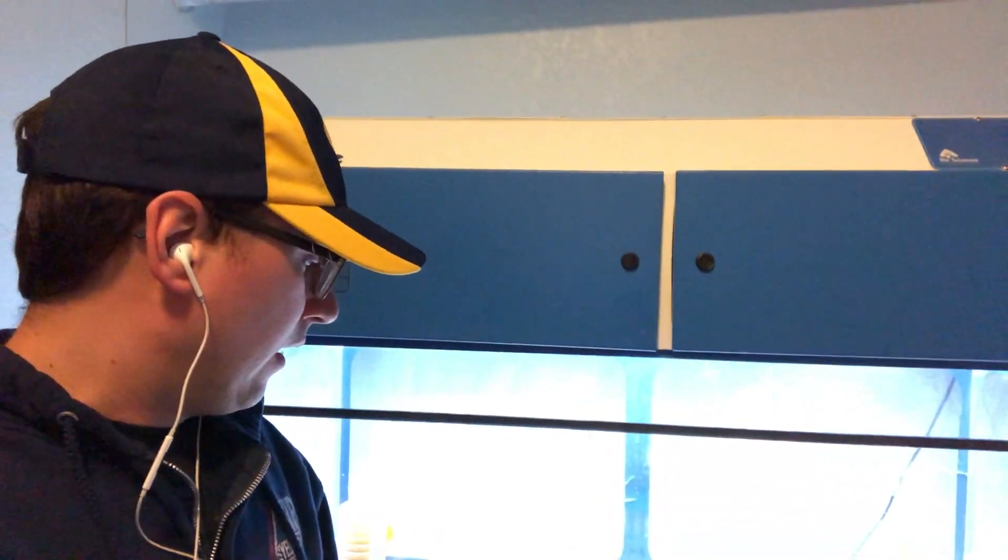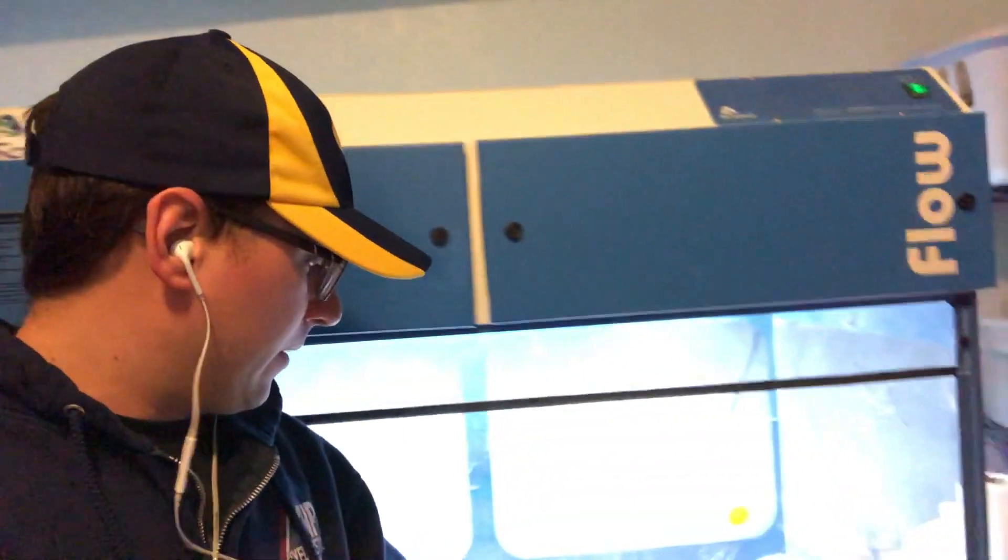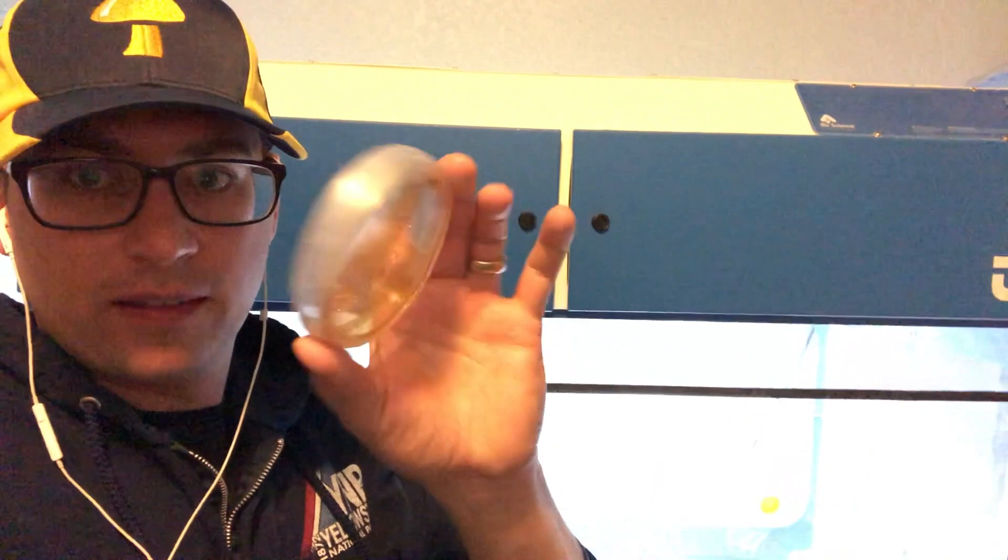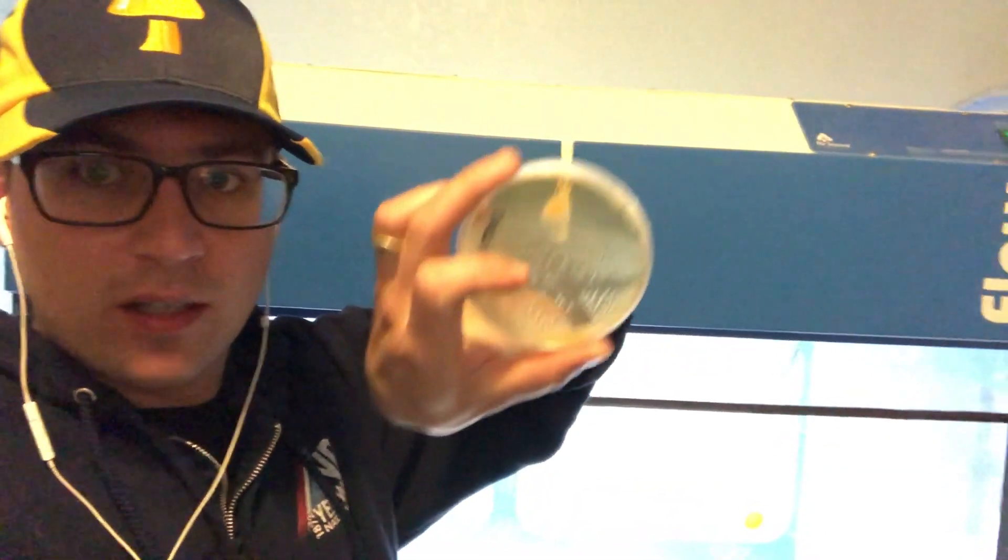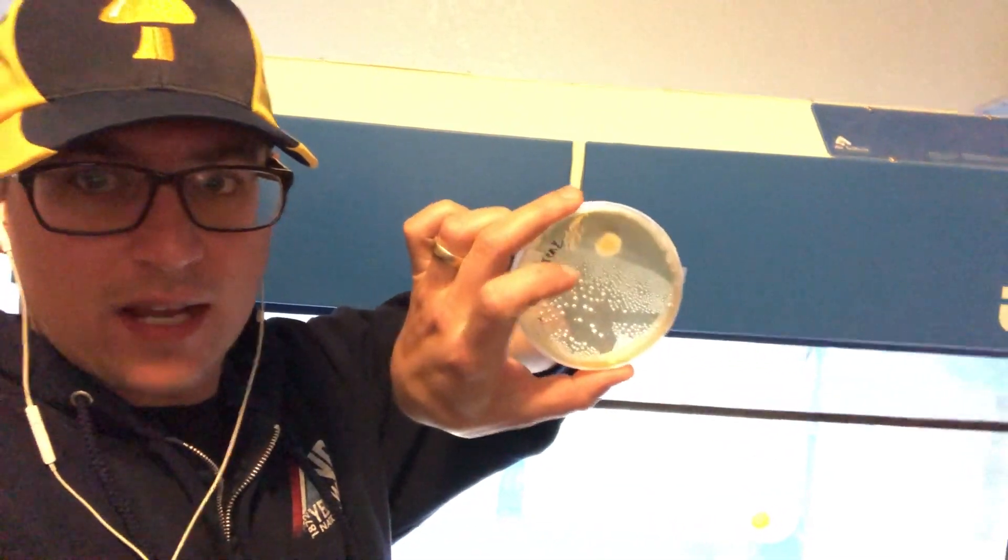So at the same time we've got our black pearl king that are starting to grow out. These were just single spore isolates that came from a 1 times 10 to the 4 serial dilution.